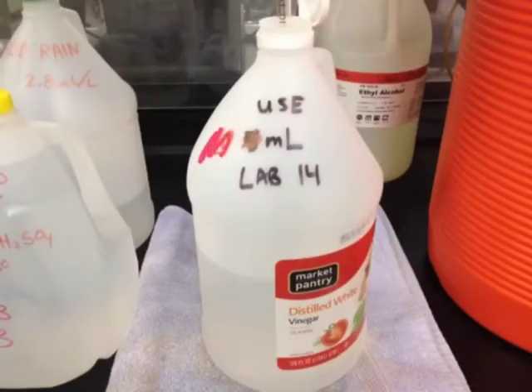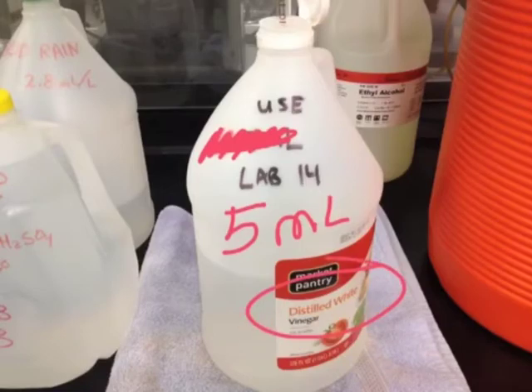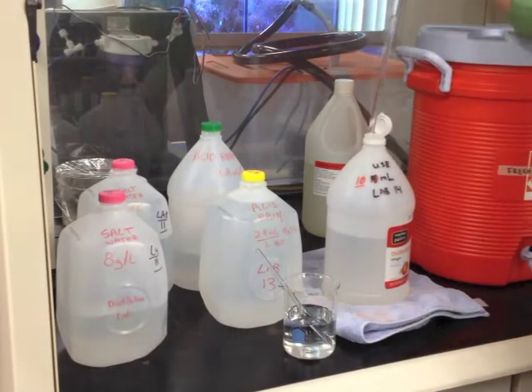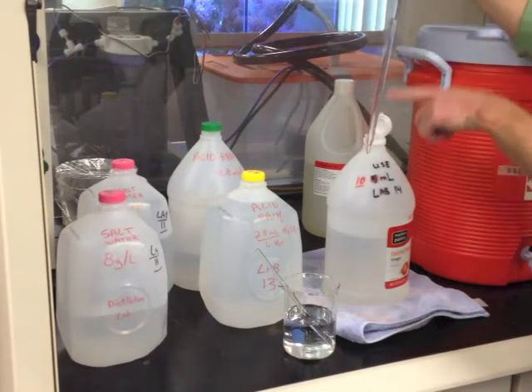Go ahead and add 5 mL of vinegar. Use the pipet — hold the pipet, and as you roll it up, it's going to fill the pipet with liquid. As you roll it down, it's going to let the liquid go back out into your beaker. Roll up to get 5 mL of vinegar, then roll back down to add that 5 mL to the water sample.